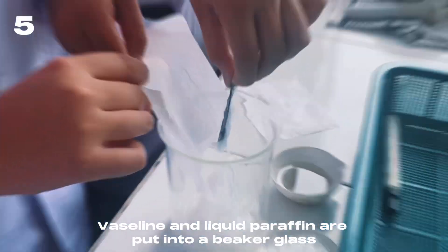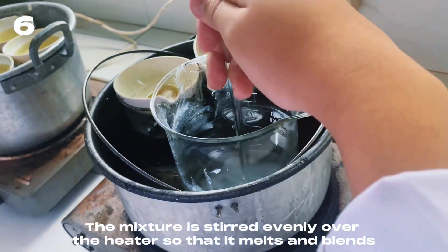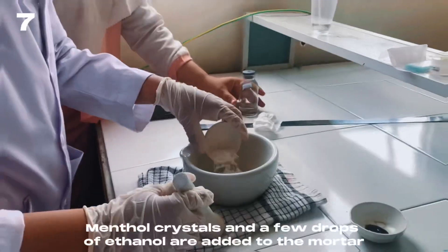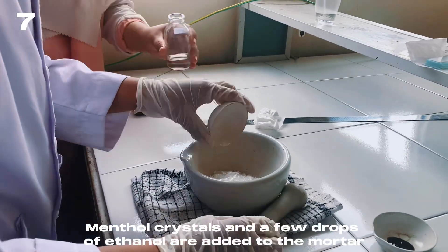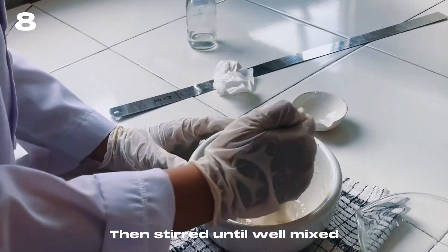Vaseline and liquid paraffin are put into a beaker glass. The mixture is stirred evenly over the heater so that it melts and blends. Menthol crystals and a few drops of ethanol are added to a mortar, then stirred until well mixed.